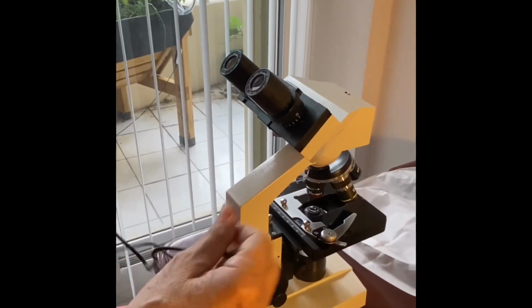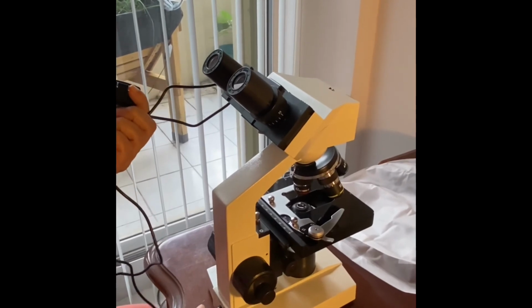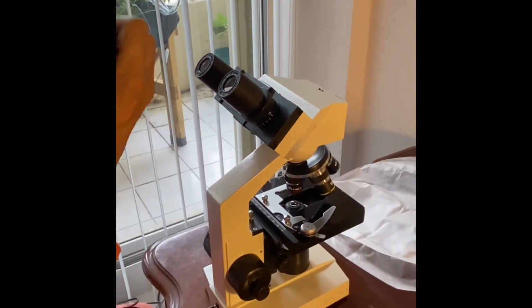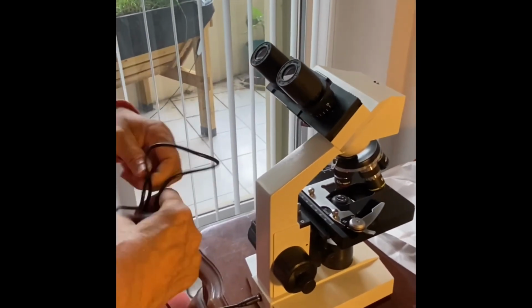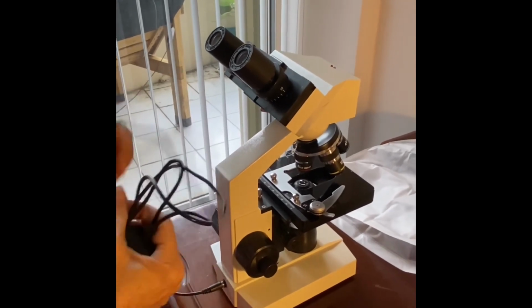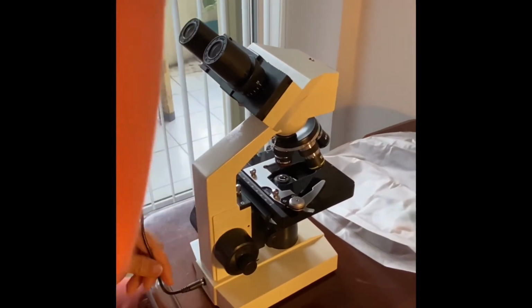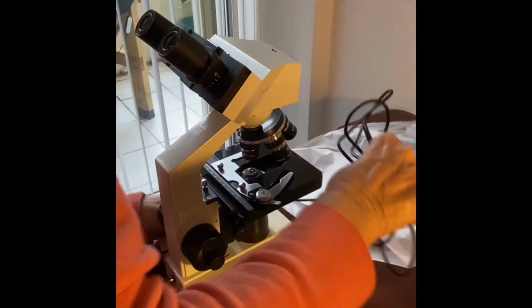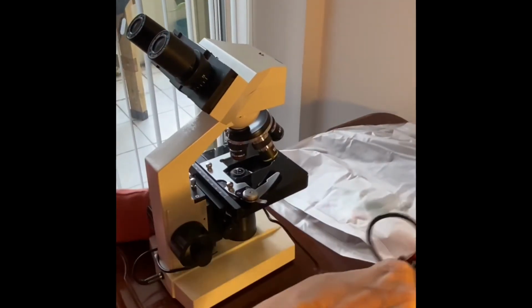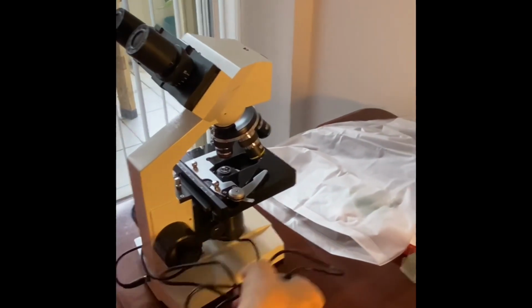The cord is here, and in my case, it's attached to the microscope. So you can disconnect this cord and just wrap it up like this. Whereas if it doesn't disconnect, then you would wrap it around the base like this until the end, and you will store it this way.